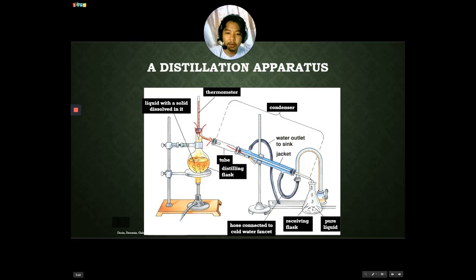And then, the steam will flow here. No, dito, mali yung linya ko. Dadaan siya dyan. And then, it will be cooled by a water source. No? Sa laboratory, walang water. So, hopefully mag-play yung video. We did an alternative to do that. And then, pag cool na siya, it will return to its liquid form and you will receive the pure liquid you are looking for. So, this is supposedly part of your midterms exam in the laboratory. You either set up filtration, you either evaporate something, you either manipulate the Tyrrell burner, or you set up the distillation process. So, magbubunutan sana kayo, and you have to show it to me, 5 minutes, walang magtuturo, hindi ako magsasalita, you just have to show me.